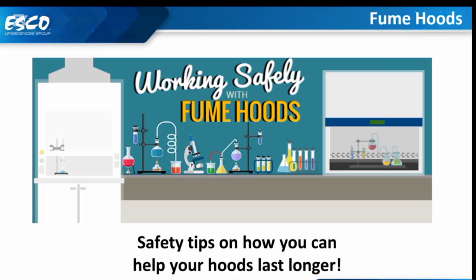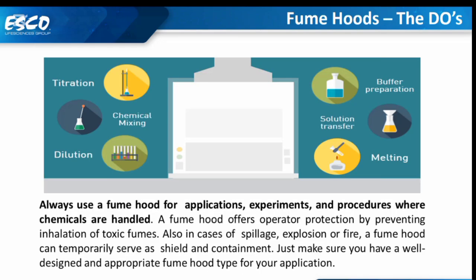Some pointers when using your fume hood. Let's look at some of those do's and don'ts. So probably we start with the do's first. Always use your fume hood for applications, experiments, and procedures where chemicals are handled. A fume hood offers operator protection by preventing inhalation of toxic fumes.